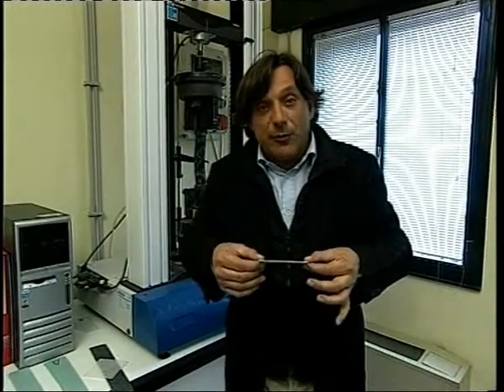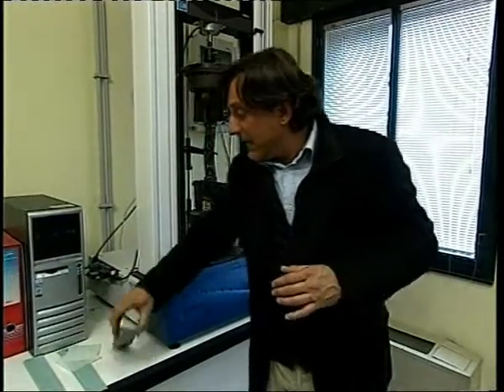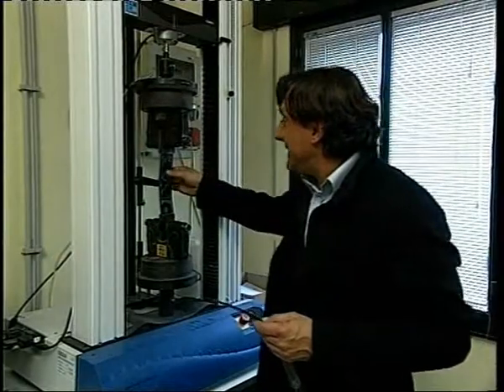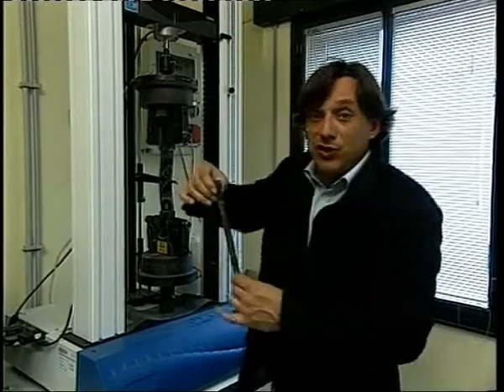Fabrics are an essential component today because not only do they offer better workability and resistance, but they also guarantee the stability of the layer of final product at the worksite under any conditions, such as thermal shock, the dimensional instability of the support surfaces, etc. Mechanical strength is tested using this machine, a dynamometer, a precision instrument that measures a product's mechanical resistance to traction in both the longitudinal and transversal directions.